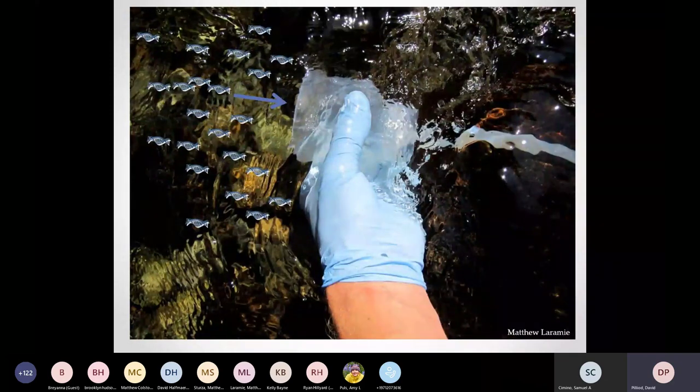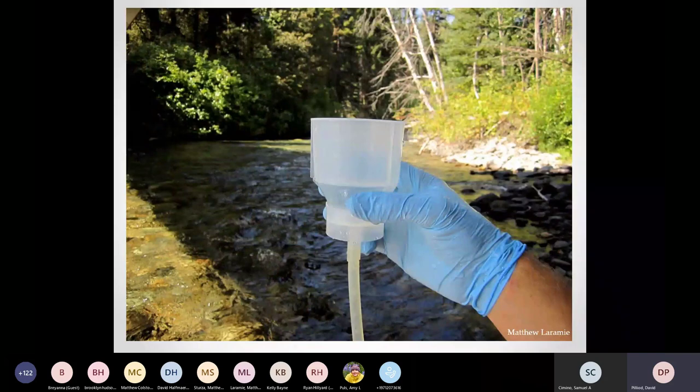And ideally you have to somehow capture that DNA from the environment and somehow concentrate it, make it into a sample that you can understand something from, and realize when you're collecting DNA from water that you're getting all the DNA that was captured by that sample. So it's not just your target organism, it's DNA from microbial organisms, prokaryotes, eukaryotes, animals, plants, and so forth. So you are dealing with a very complex cup of water there, a complex sample, and then the trick is to be able to detect the organism or organisms that you're particularly interested in.